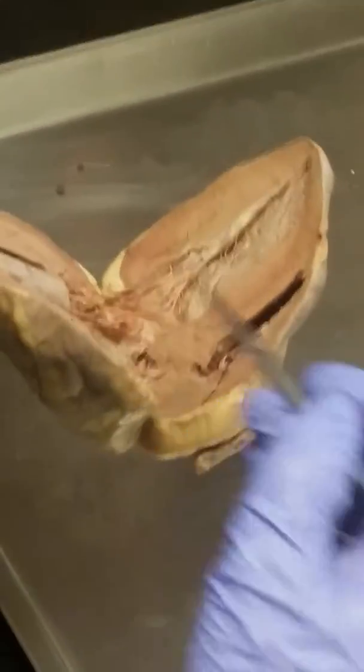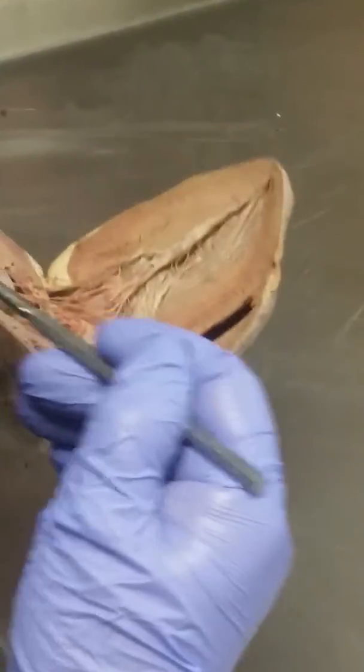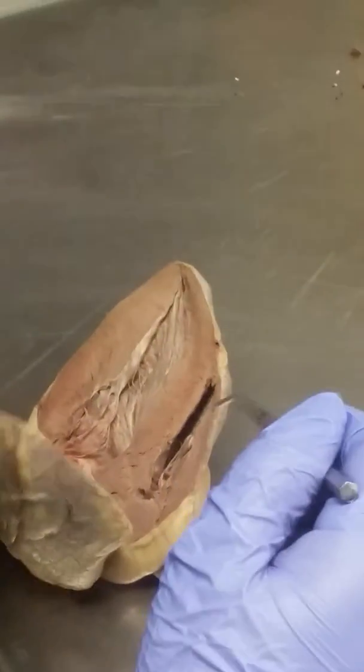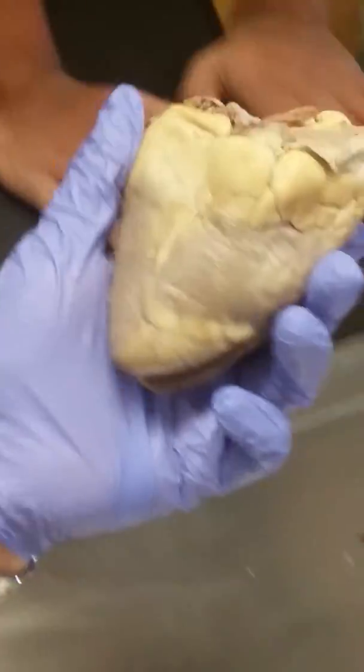Trabeculae carneae, chordae tendineae, papillary muscles, valves, and that's it. So be sure to grab one of the hearts and just poke through it and see, where am I now? What chamber did I enter? Where did I just come from? Right? Any questions?